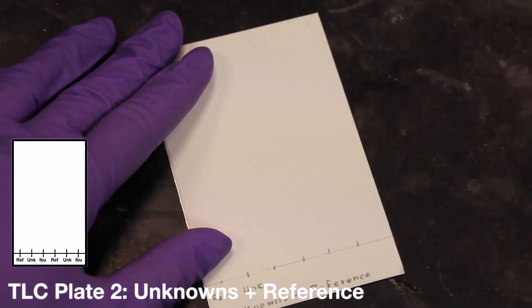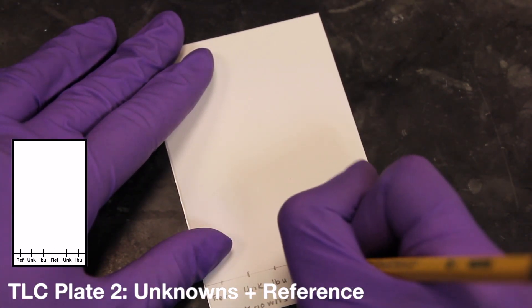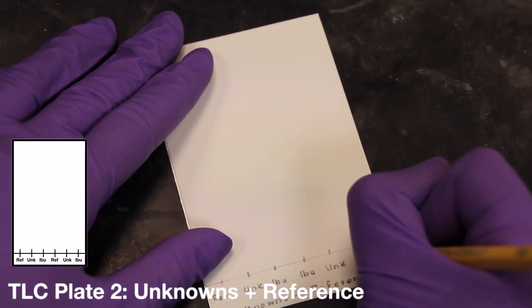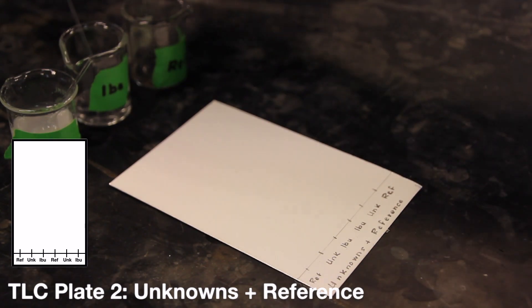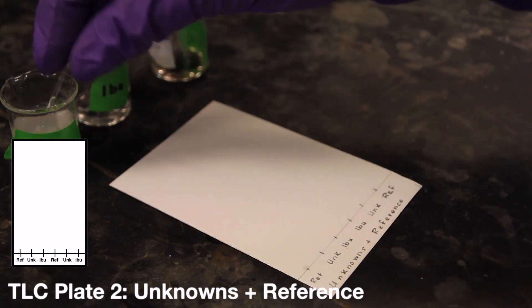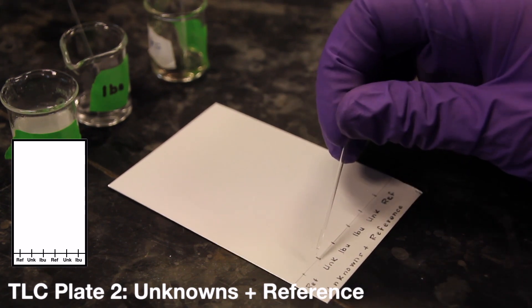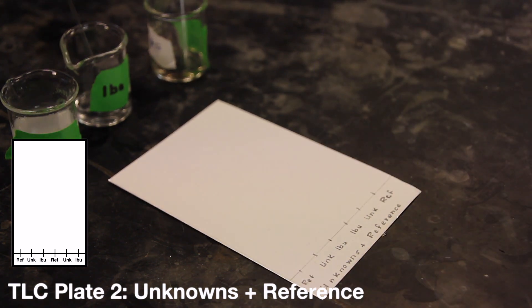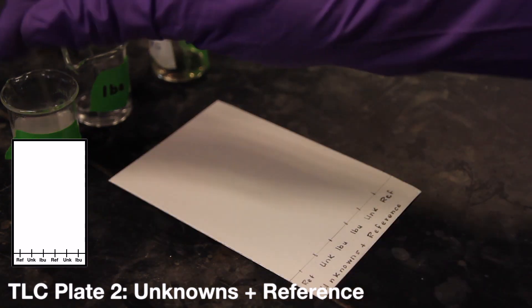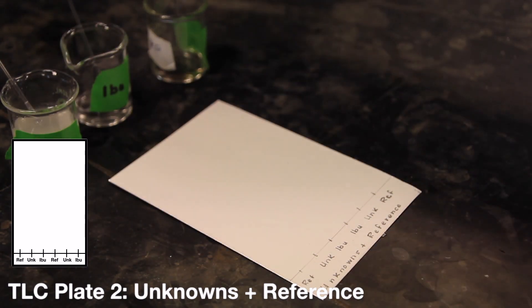Next, you will be working with your second TLC plate. This plate will ultimately contain your unknown analgesic and reference mixtures. Begin by spotting the reference mixture, which contains 4 of the compounds under analysis: acetaminophen, aspirin, caffeine, and salicylamide. Also spot ibuprofen, since it is not a part of the reference mixture, and the unknown solution that you have just made.